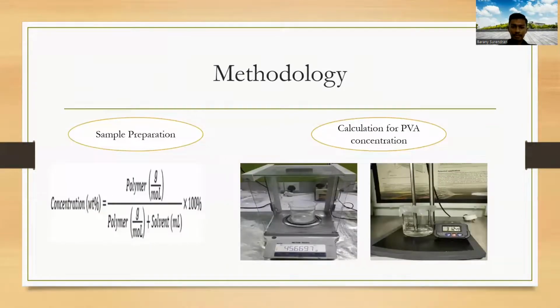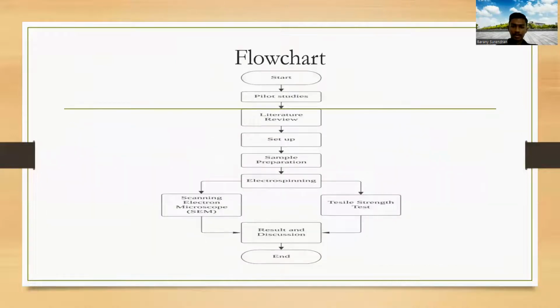So this is my methodology process. Here I show the sample preparation, where I use the concentration formula. And these are the processes when I am mixing the PVA solution. And this is my flowchart based on my studies.